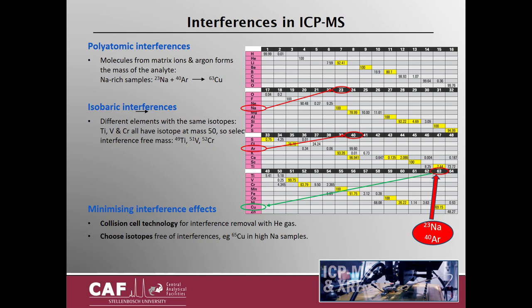Another type is isobaric interferences, where two elements have isotopes at the same mass. So titanium, vanadium, and chromium all have isotopes at mass 50, but they each have another mass without any interferences: titanium at mass 49, vanadium at mass 51, and chromium at mass 52. To minimize interferences, we can use collision cell technology to remove them with helium gas, or we just choose isotopes free from interferences — for example, using copper-65 rather than copper-63 in high sodium samples.